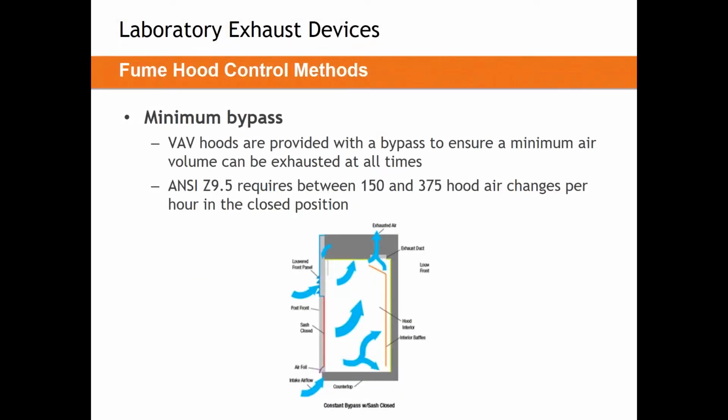So I mentioned earlier, we would come back to talking about fume hoods in the closed position. Sometimes we get the question of, it's fairly easy to calculate what flow we need in the open position, but what do we do at closed? Some campuses will have a set standard. They'll provide 1/3 of the opening position's flow at the minimum flow. Others will try to target a face velocity of 100 feet per minute at closed.